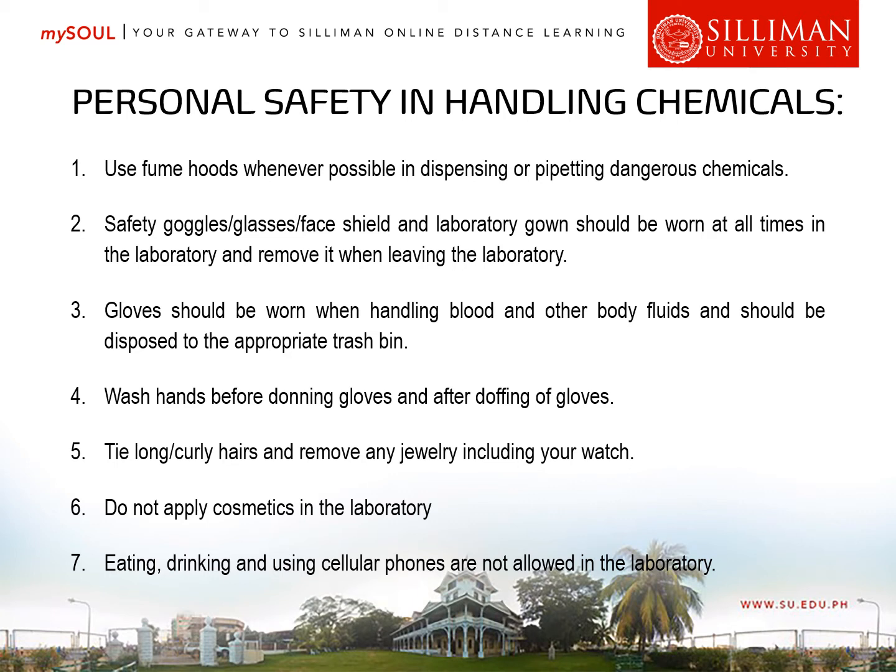So this is a very common mistake for some because they tend to wear their laboratory gowns even outside the lab room. Okay, when walking in the hallways, when walking on the streets, you really need to remove your laboratory gowns before going out. That's the protocol there. Number three, gloves should be worn when handling blood and other body fluids and should be disposed to the appropriate trash bin.